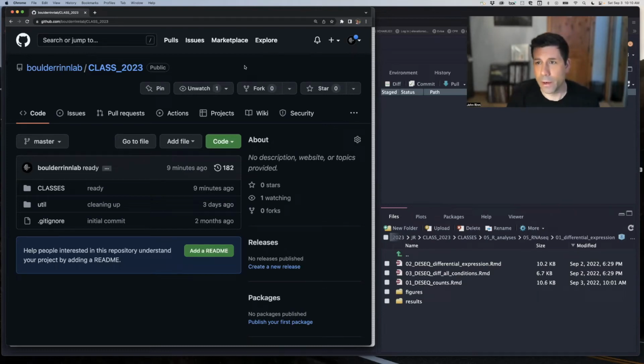Welcome everyone to our class on DESeq, where we are going to start to take the counts from the pipeline we ran and see what DESeq wants for those type of values. There's a little bit of background we should go through of what came out of the pipeline, what DESeq wants for different things, and that's what we'll cover here today, and actually run DESeq to get normalized log counts that we'll want in the future.